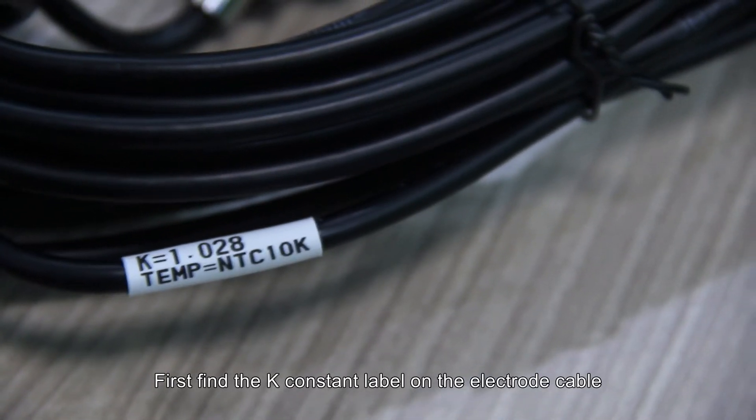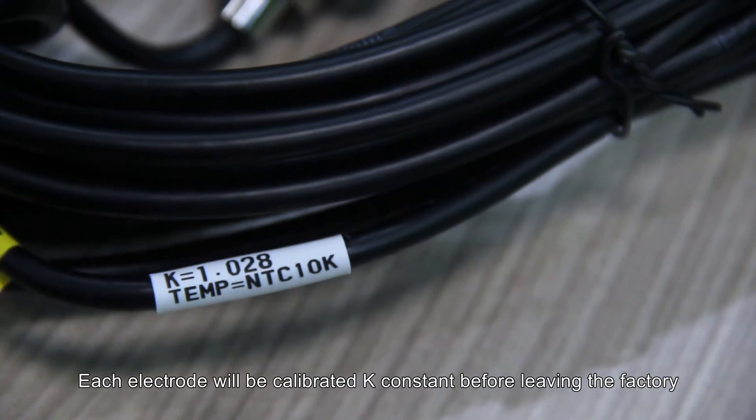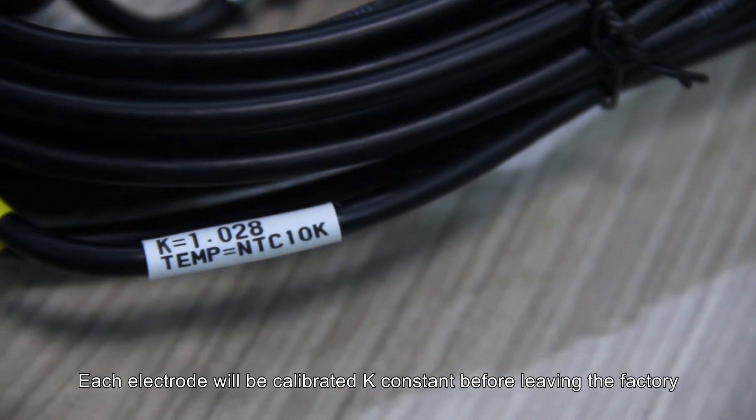First find the K constant label on the electrode cable. Each electrode will be calibrated K constant before leaving the factory.